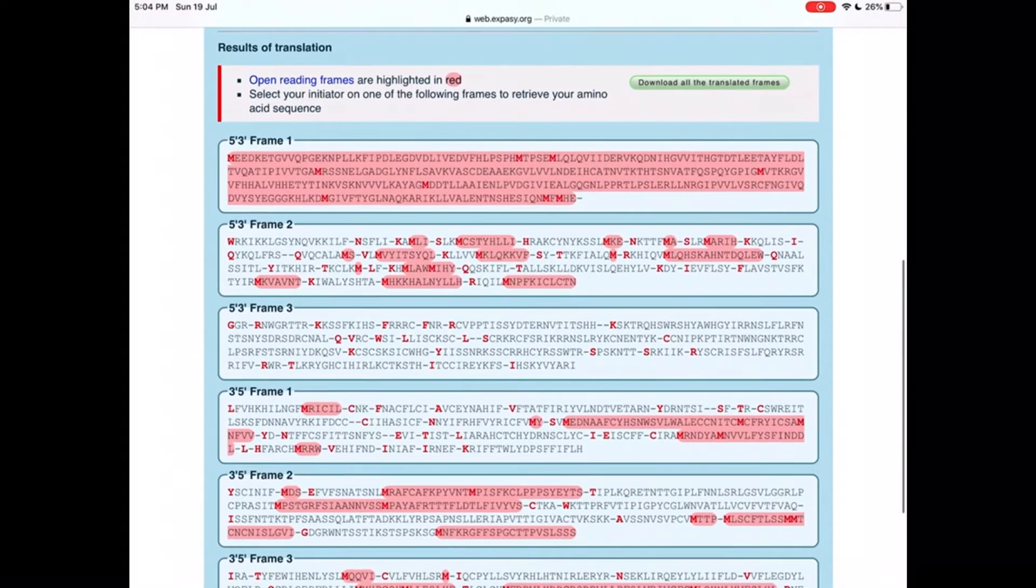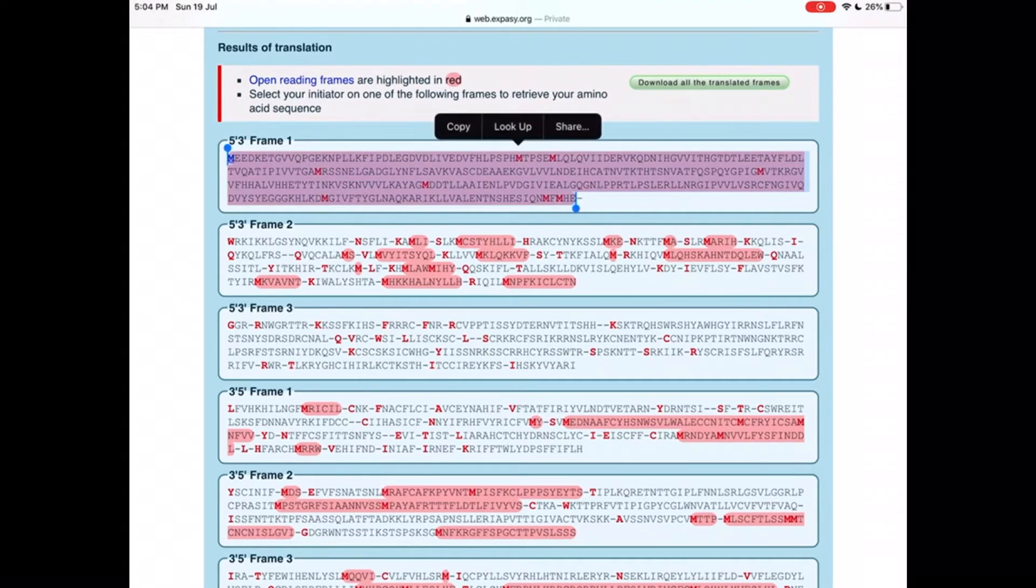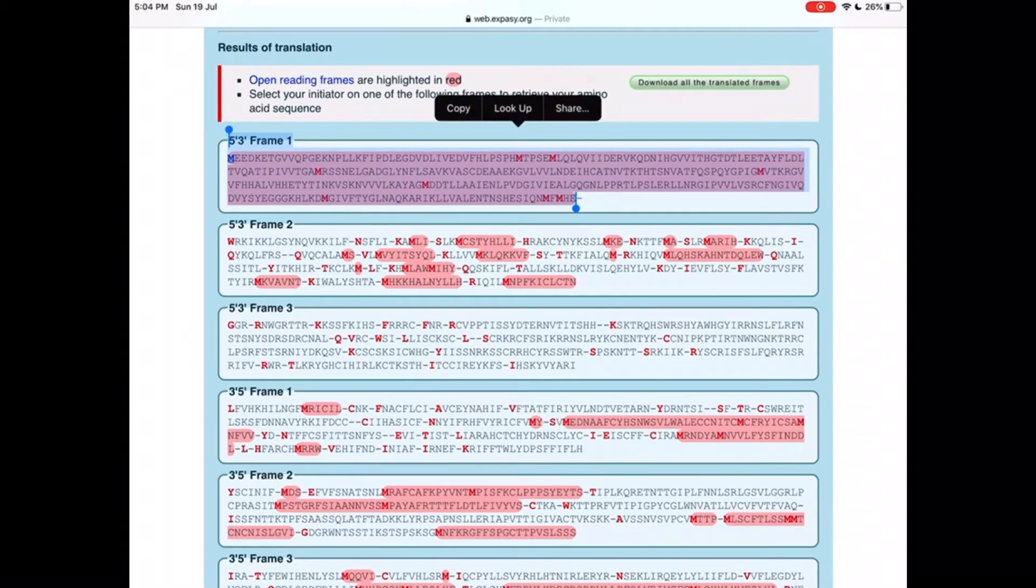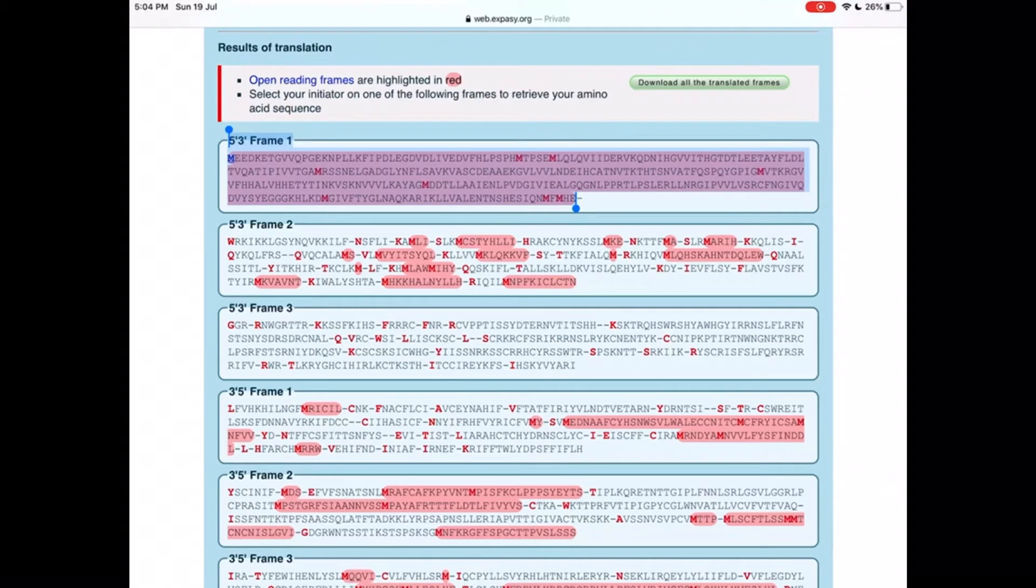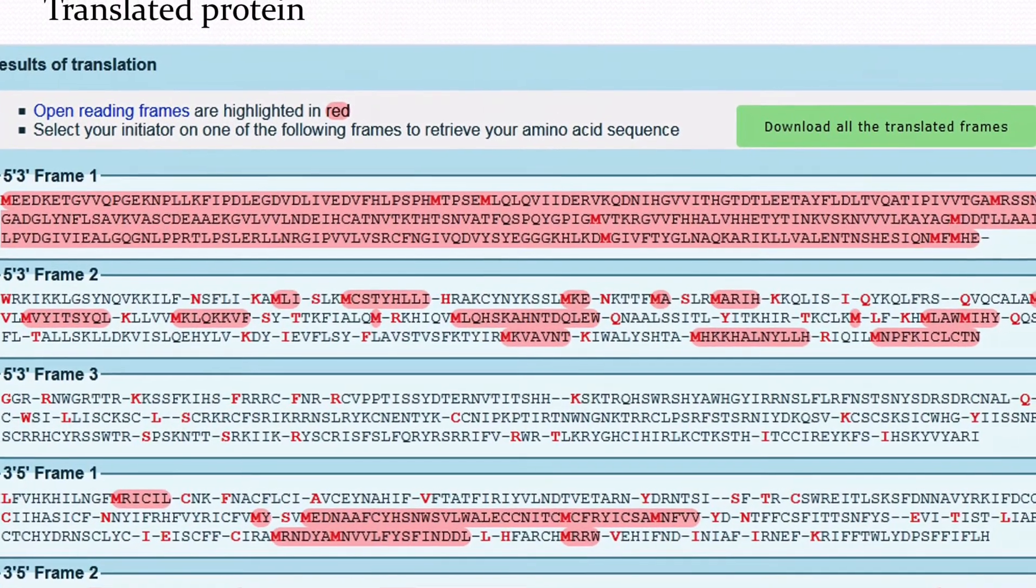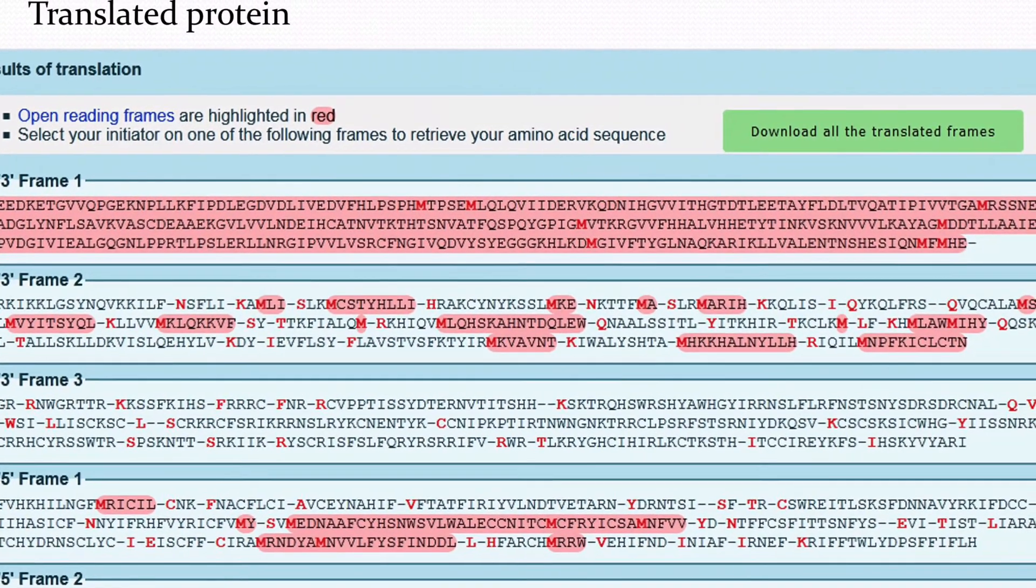So this 5' to 3' frame 1 is the amino acid sequence that corresponds to the DNA sequence we have given.